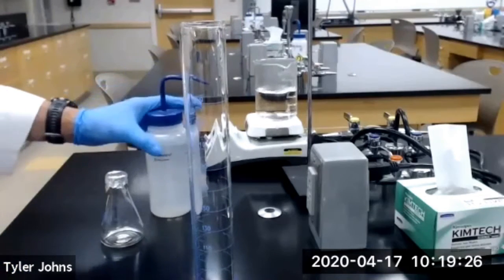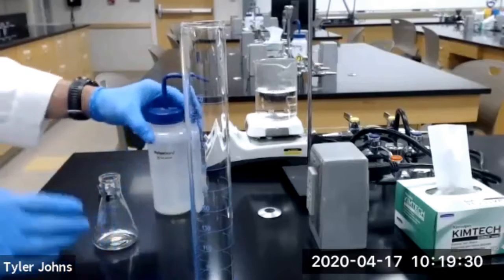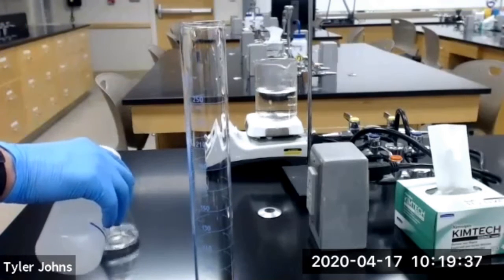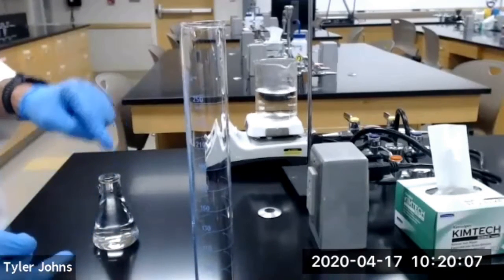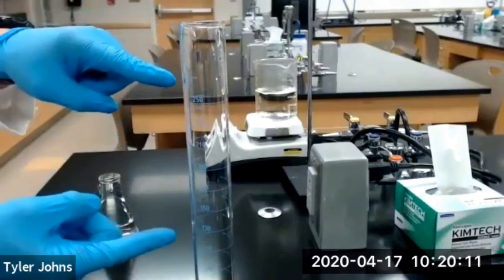I have some deionized water here. I'm going to remove the foil lid and fill our Erlenmeyer flask with the water. Then we're going to transfer the water to the 250 mL graduated cylinder.